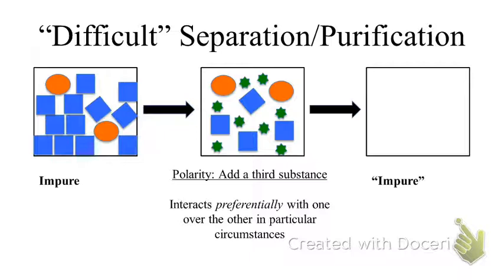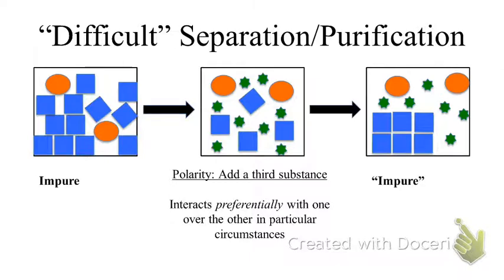So what we're going to hope is that as we add temperature or add heat to our reaction, the solvent starts to interact with more or both of them, and as we remove heat from the system, the solvent starts to interact only with one and not with the other. Okay, so the heat will allow us to get everything to dissolve, and then once we cool it down, we can end up getting our crystals back. So we're going to have to rely on solubility changing with temperature for each of our compounds.